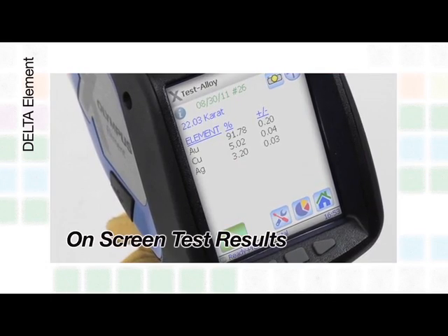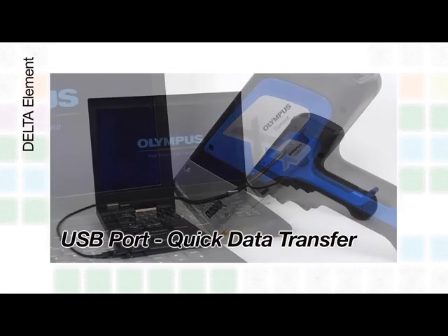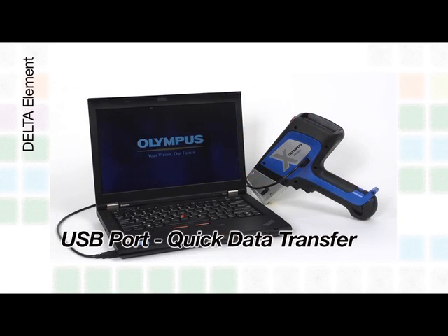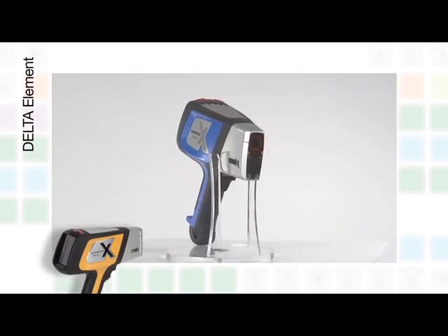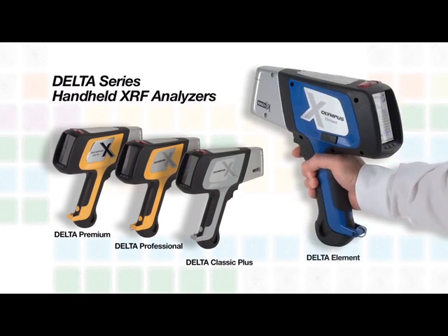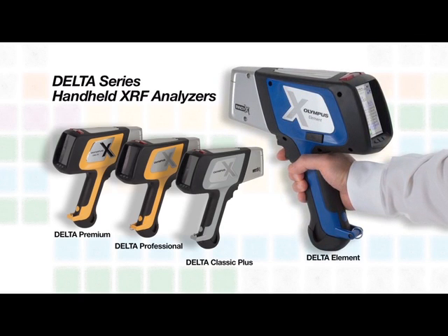Test results can be viewed on screen, and the analyzer has a USB port for downloading results and seamless PC control. With the introduction of the Element, Olympus continues to expand the Delta family to make handheld XRF more accessible and affordable.